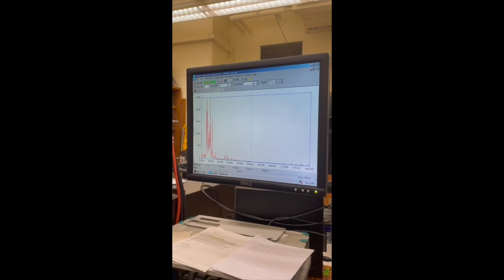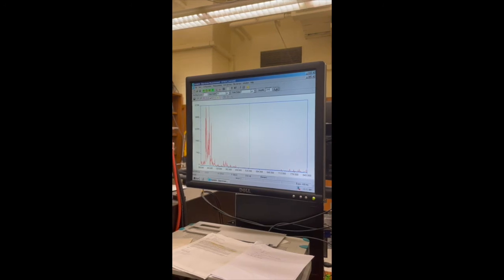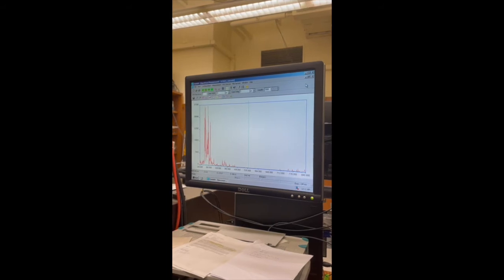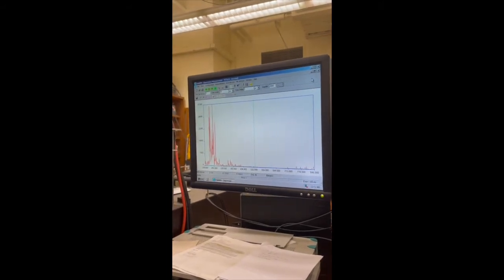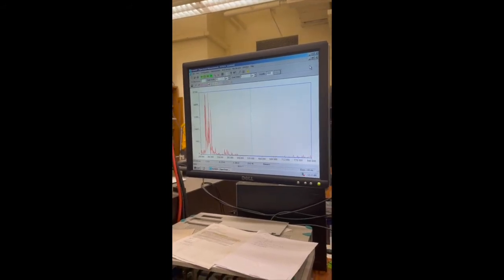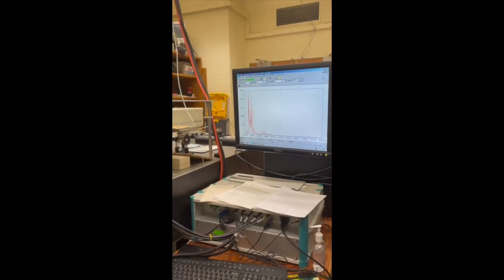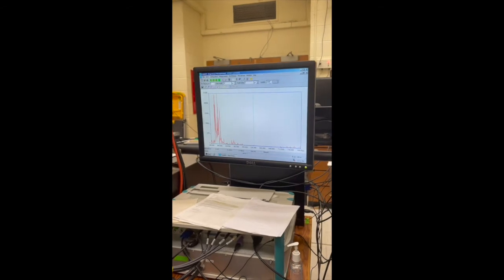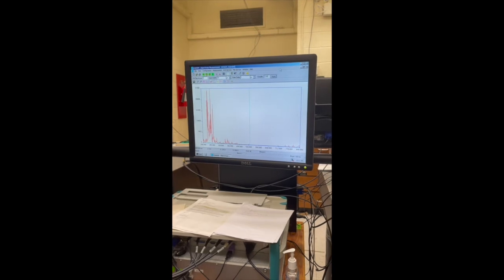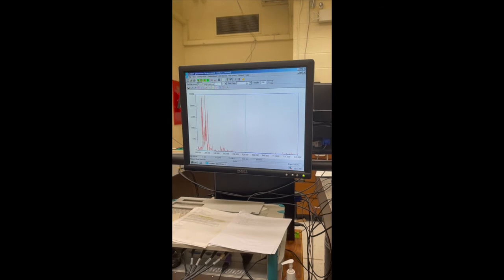So it's important to know that there is a limit to how high you can actually set this thing. And it's really important that you don't set that value too high, because this is the one value that really can permanently damage the entire spectrometer. So you're not ever going to want to set that high. In fact, we keep it as low as we possibly can go. So let's keep turning up the amplification a little bit. We're looking for what's called overflow on the chip. So if we set it to 2200 and say apply, go ahead and fire that.